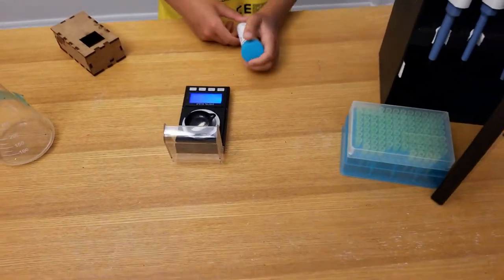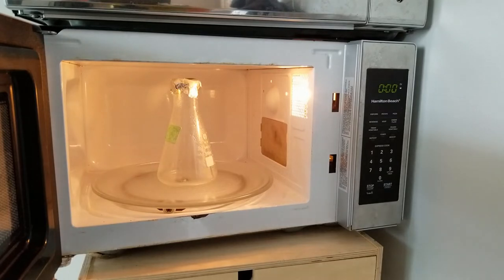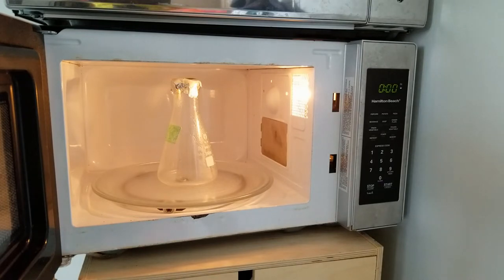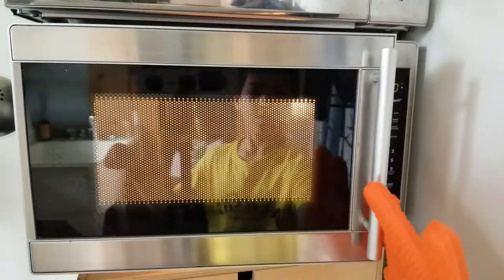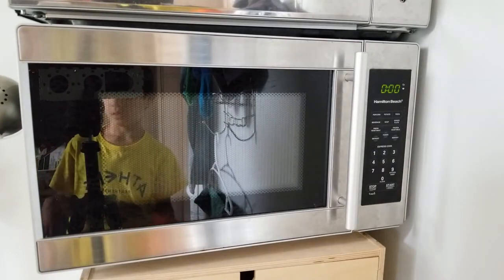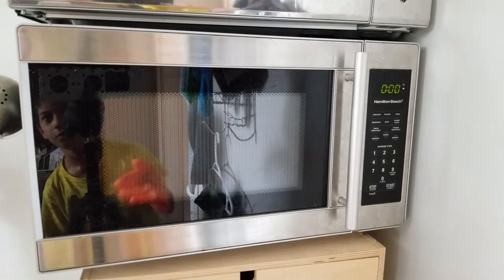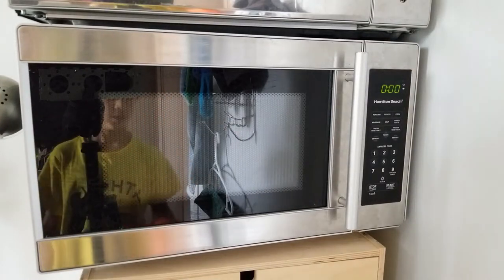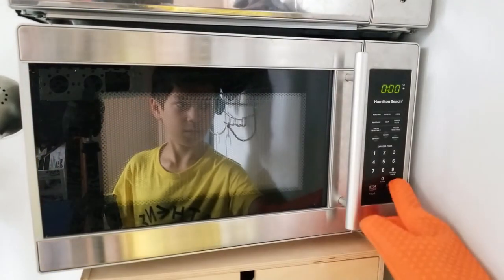Now we're gonna put the solution into the microwave so that the LB agar dissolves inside the flask, and also to kill any bacteria that might have accidentally gotten in. We start it for a few seconds, and once we see foam come out, we take it out, swirl it around a bit, and check if there's any LB agar remaining that hasn't dissolved.